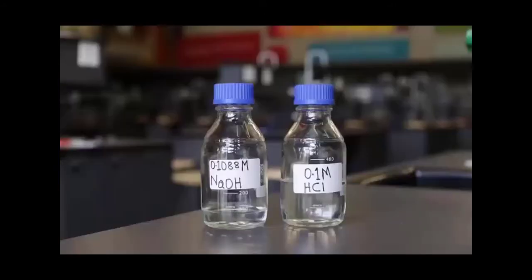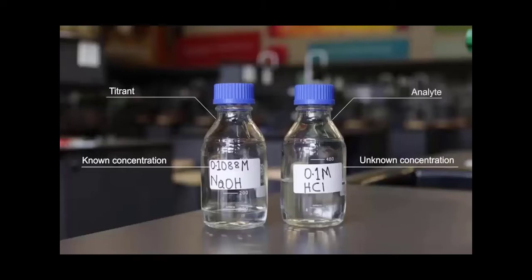Here we've got two flasks. One has our unknown acid that we have the approximate concentration of. We're going to titrate it using a standardized sodium hydroxide solution that we know is 0.1088 molar, four significant digits. It's our acid that we don't know about, only one sig fig, so we'll need a titration to figure that out. And we'll start off by taking that acid with approximately 0.1 molar and put it in a flask.